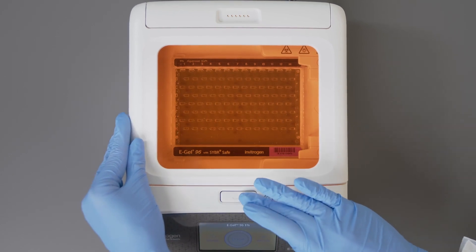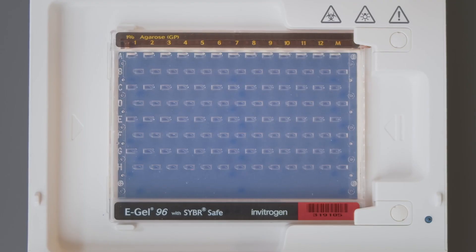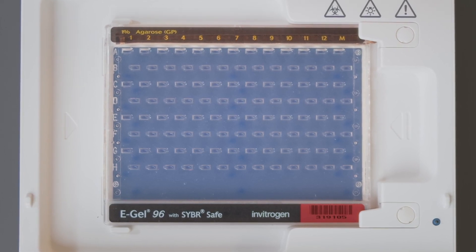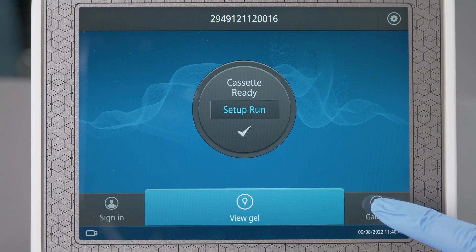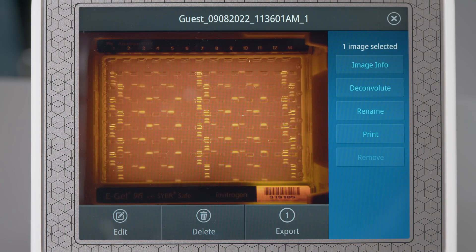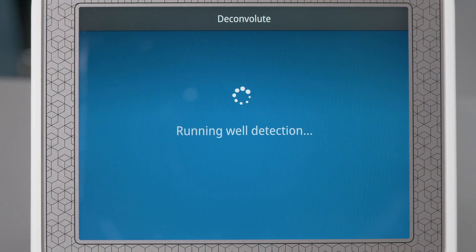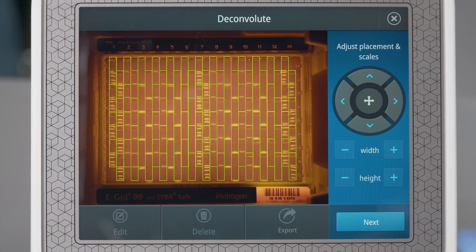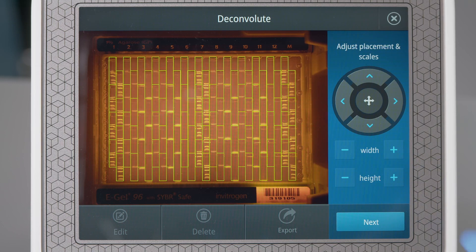Invitrogen E-Gel 96 Agarose Gels have a staggered well distribution to optimize the distance of the runs. To help you with interpretation, we have included a special function in the Invitrogen E-Gel PowerSnap Plus electrophoresis device that we call Deconvolution. Deconvolution allows you to transform the image of your 96-Well E-Gel Agarose Gel into more convenient formats.